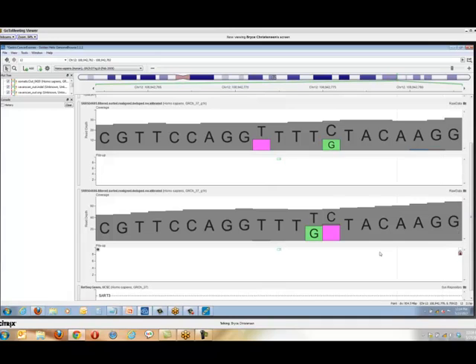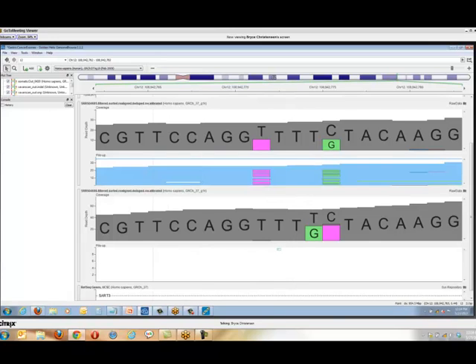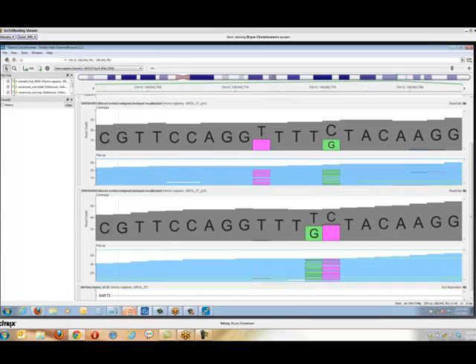And it might take a while for these to come up. These are some gigantic BAM files that are sitting on an external drive that's really slow. So with that, I think I'll go ahead and rest my case. We'll save any questions about this portion until after the break, but we need to try to catch up with our schedule.